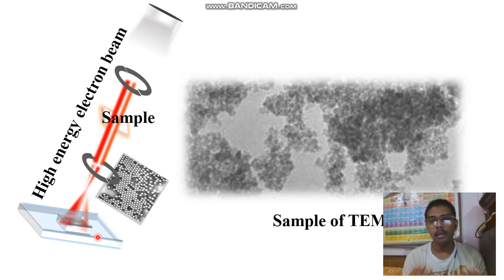Now, when we analyze the images, we take those 15 to 20 images into software, and then average them. When you are averaging, the noise is cancelled out. So after averaging, you will get an image without noise, but it is a 2D image, and you have to get the 3D image. Then by some other image processing, which we will discuss in another video, they get the 3D image of the protein. So first noise cancellation and then the 3D image formation.